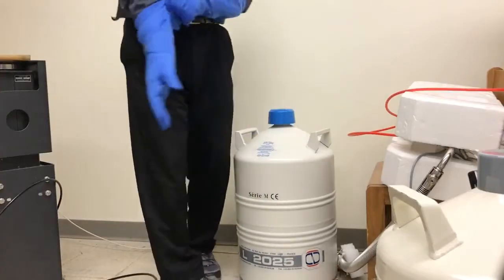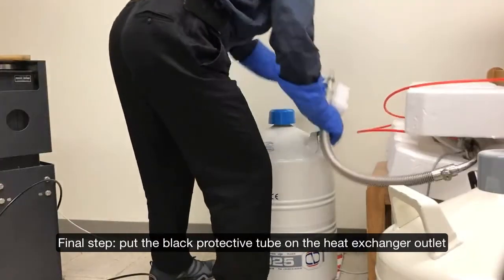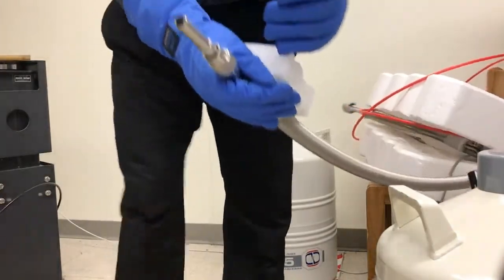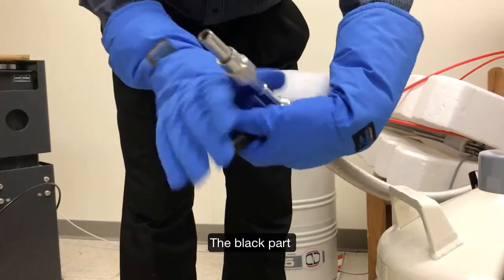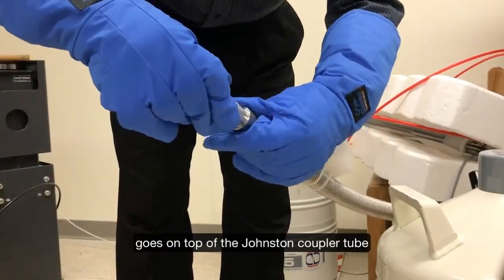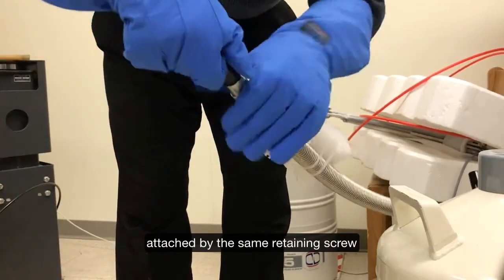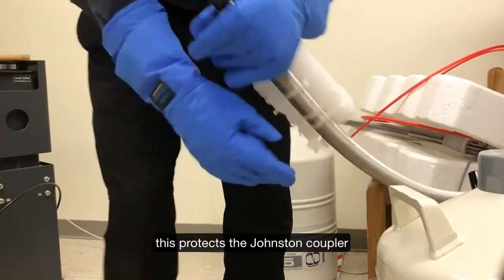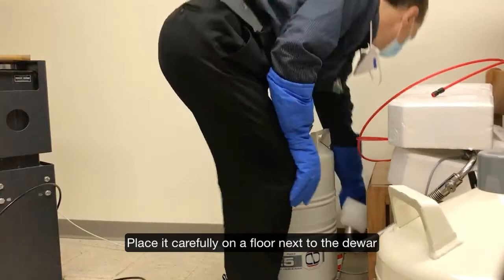Finally, the cold end of the heat exchanger needs to be protected by this cap — it will be metal going in — and then I screw it in. This protects the Joule-Thomson junction. So I can now put it back.